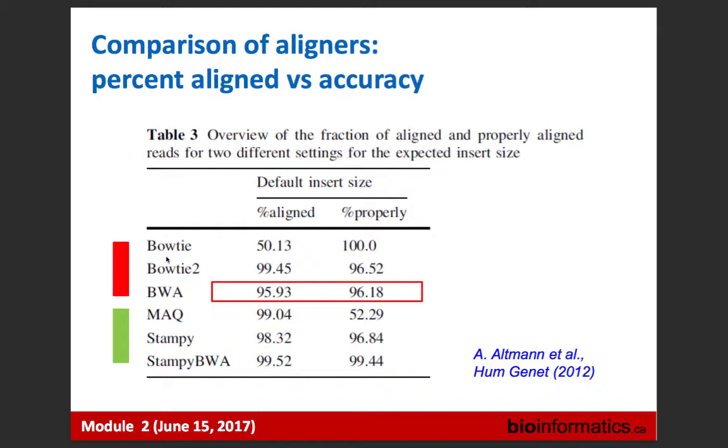So one thing is how many reads from our FASTQ are placed somewhere on the genome. That's the first question. But then also the second question: out of those which are placed, how many are placed correctly? And this is, in principle, for aligners, a very clear-cut question. It's a very definitive question to ask, and we know how to answer it. It's a pretty easy task to do. It's laborious, but pretty easy.